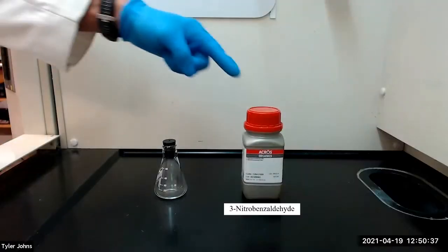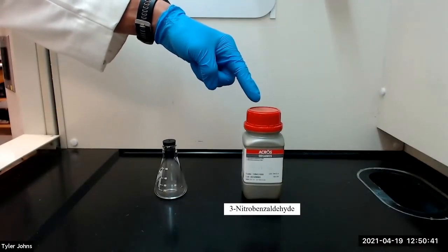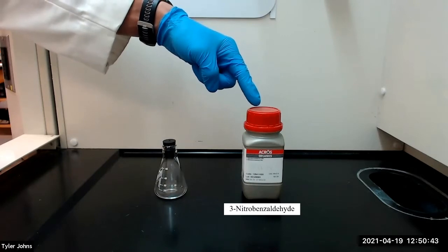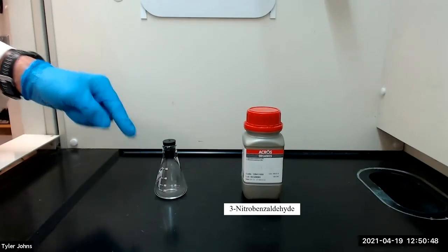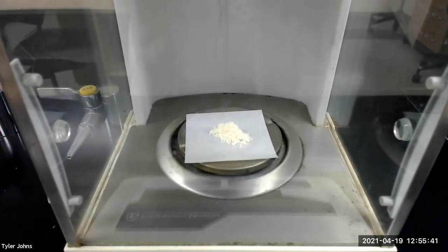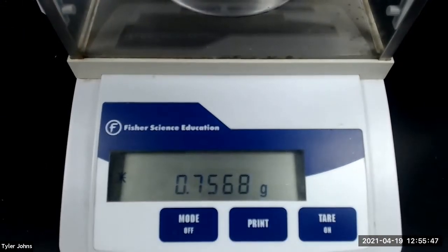We next need to add approximately 0.005 moles of the substituted benzaldehyde, 3-nitro benzaldehyde, to the 4-methyl acetophenone in the pre-weighed flask. The mass of 3-nitro benzaldehyde that we will be using is 0.7568 grams.